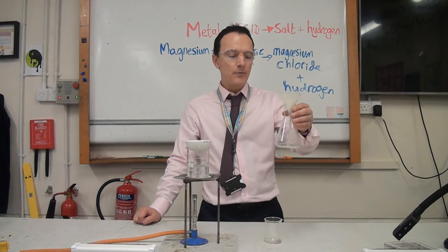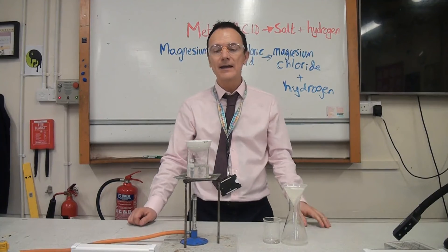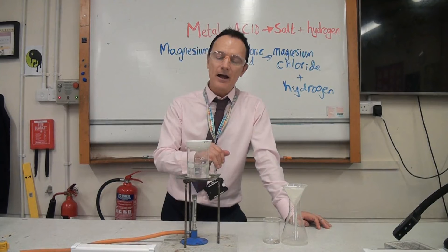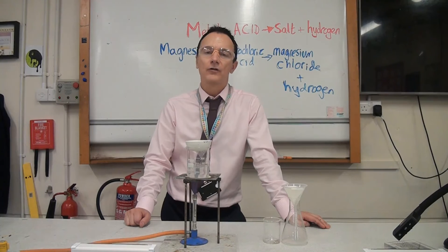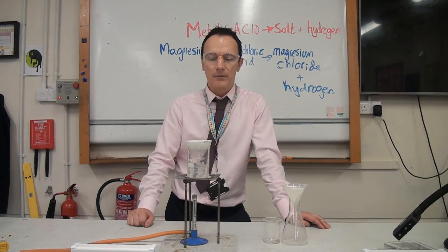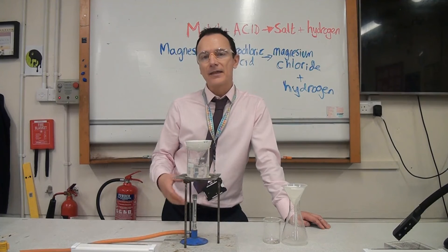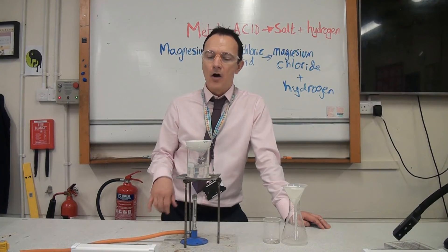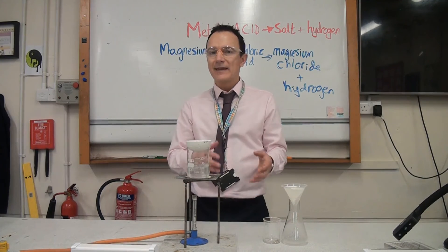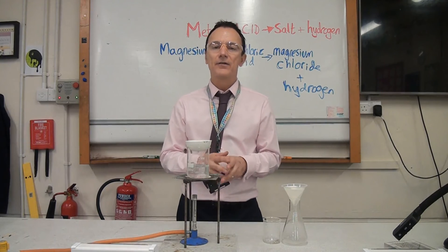When it's all filtered through, we're going to pour the magnesium chloride solution into the evaporating dish. You'll see we're heating it over a water bath for more controlled, gentle heating rather than putting the evaporating dish straight on top of the gauze. We don't heat it until all of the water has gone — we heat it until either half the water has evaporated or until we start seeing crystals appearing around the edge. At that point we take it off the heat and let the rest of the water evaporate naturally over the next few days.